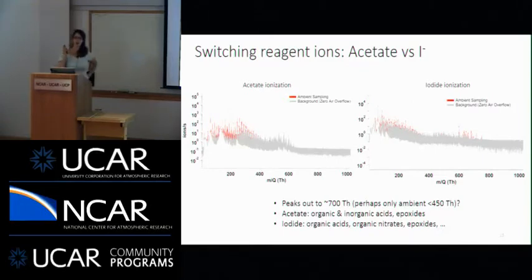So if you are looking at someone's data who has a time-of-flight mass spectrometer, the first question you should be asking is, what is your background? And have you background subtracted before you try to interpret your data? It is amazing to me the number of people who forget in the field to look at the background. My graduate student and I were guilty of this for a few days, being completely fascinated by all these peaks that appeared at about 600 Thomson units until we realized that they were all background. So the gray is the background, so watch the background.